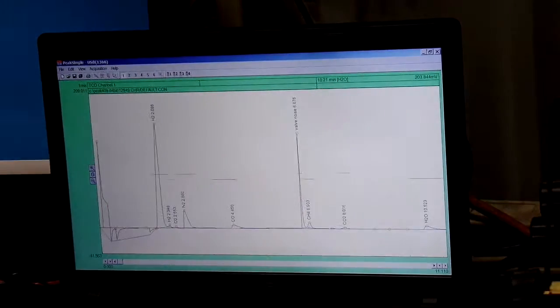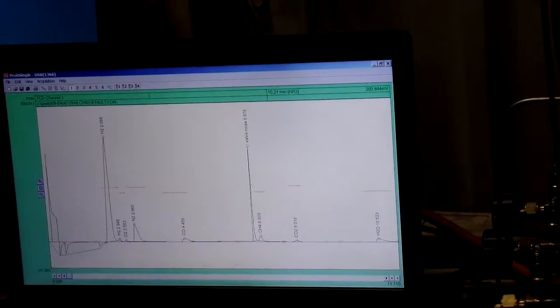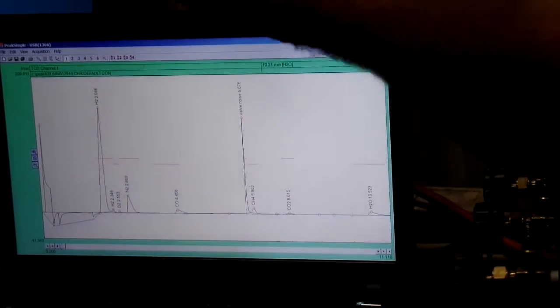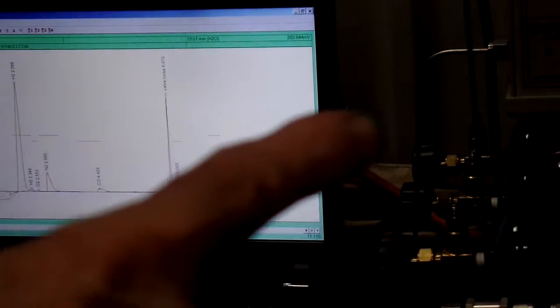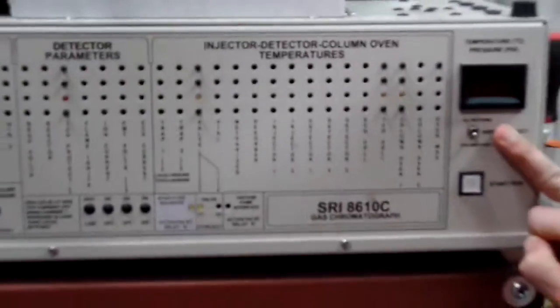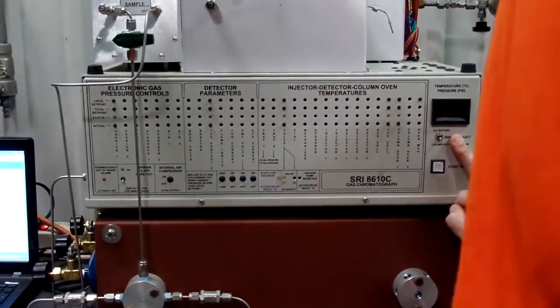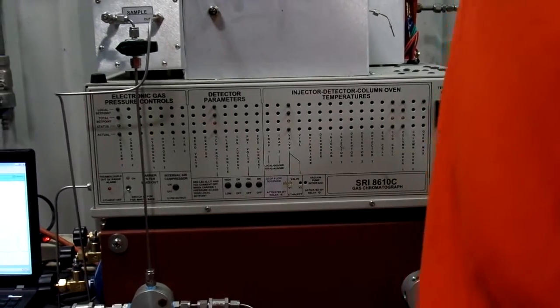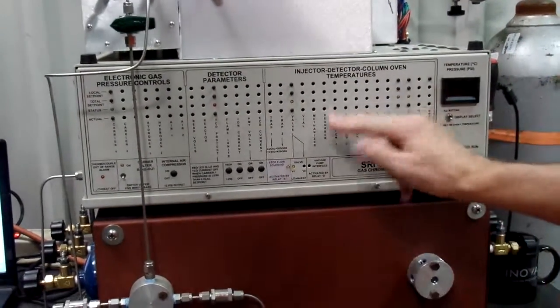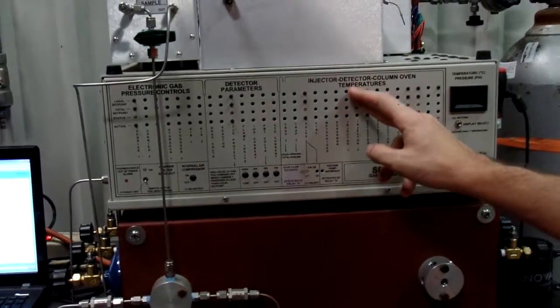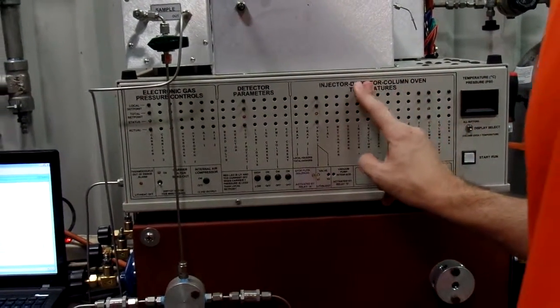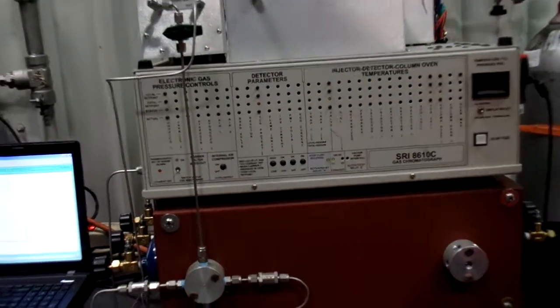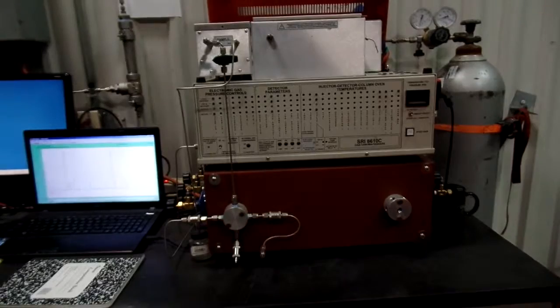And then the cycle repeats itself if you want to run again. That's it. So once it's done, it's ready to go. As long as it, so this just has to go down to 30 before you can do another launch. You'll see here, you can start it before, but I don't think it's good for the system. It'll start. It will. It's not like going to tell you no, it won't start. This is extremely accurate and pretty precise as well. That about does it.